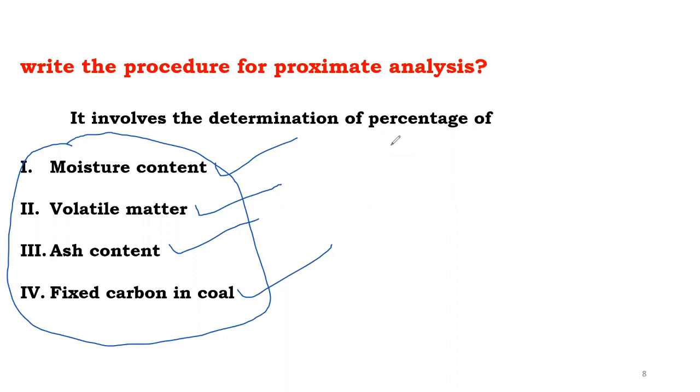Proximate analysis is also called physical analysis of the coal sample.